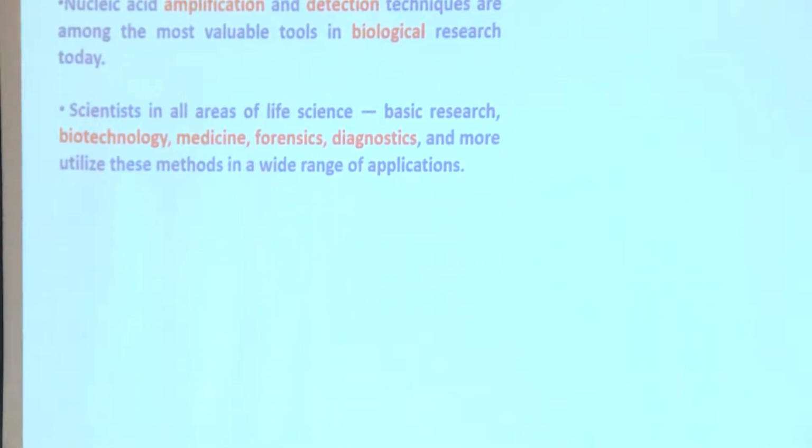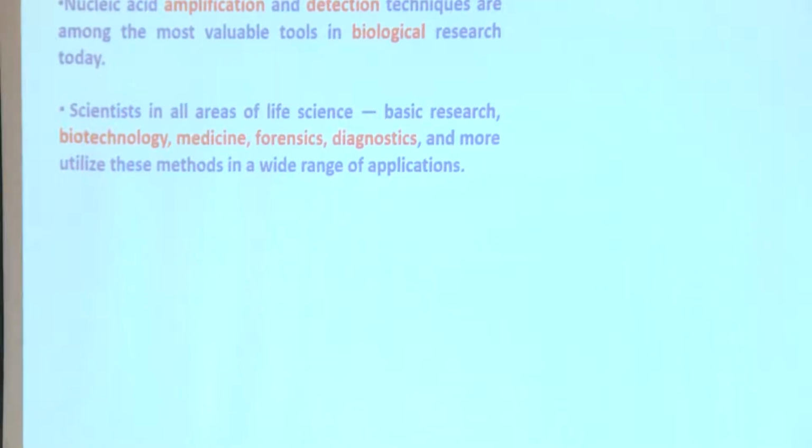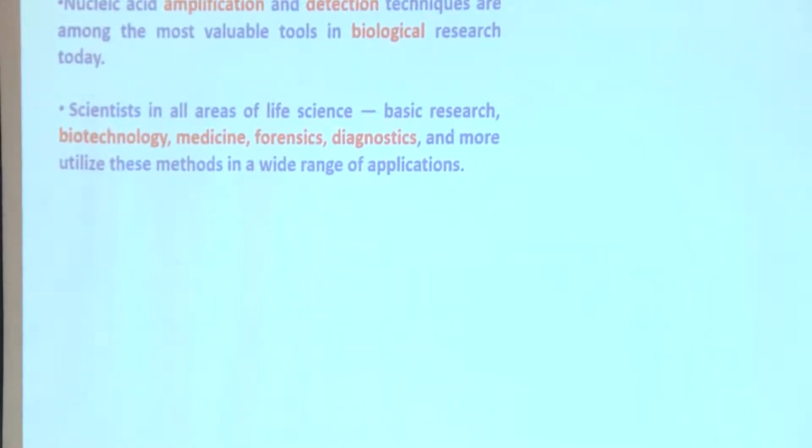Of course, virtually scientists in all branches, whether it is biology, medicine, forensics, diagnostics, plant sciences, environmental sciences, in every field of biology, you cannot imagine a research program without PCR. We are so dependent on this tool for our day-to-day experiments.